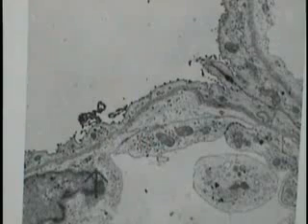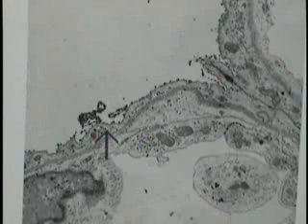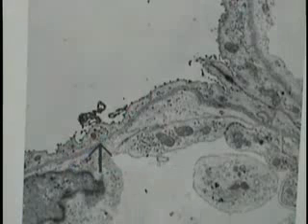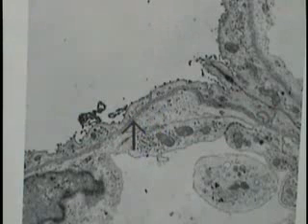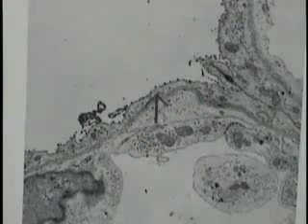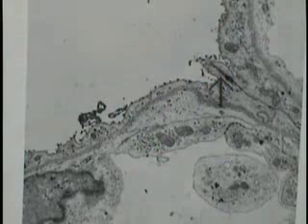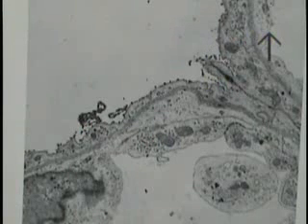Once again, this is the blood-air barrier area: endothelium, type 1 pneumocyte, the epithelium, and if one looks carefully here, one can see the fused basal laminae, or the fused basement membranes, representing each. There's a little membrane coming off the type 1 cell and of the endothelial cell, and there's a slight dense line, the interface, where these two membranes fuse. So this gives you an idea, at least with the transmission electron micrograph, of what these blood-air barriers look like. Another one is shown here.